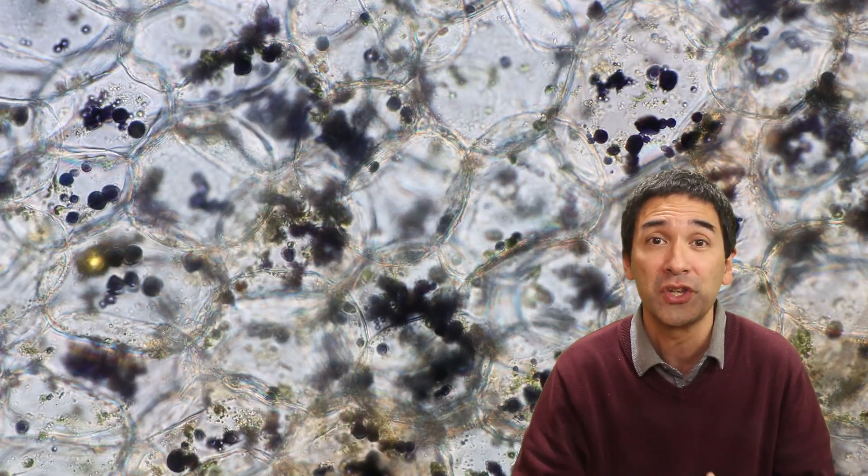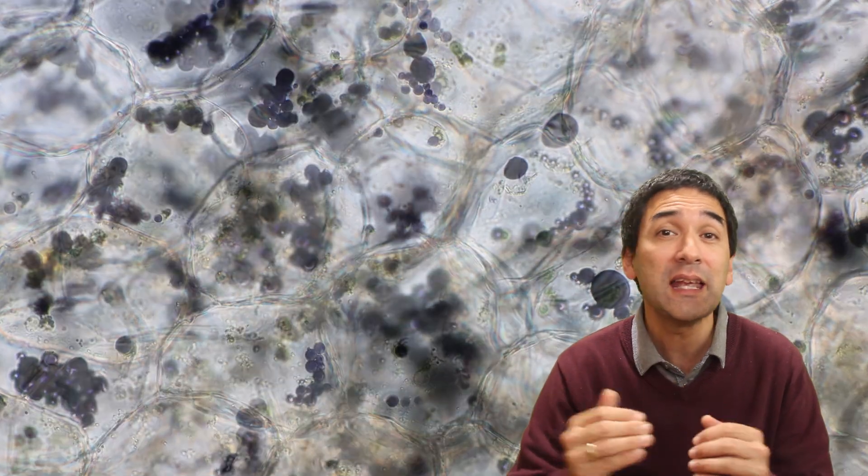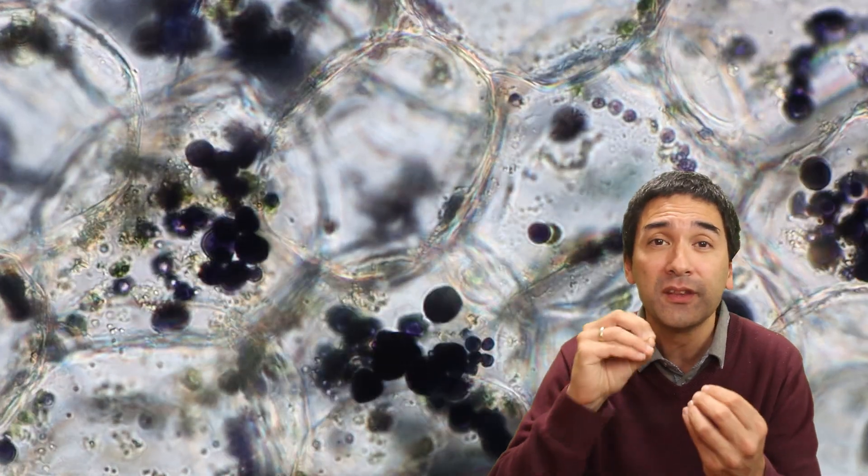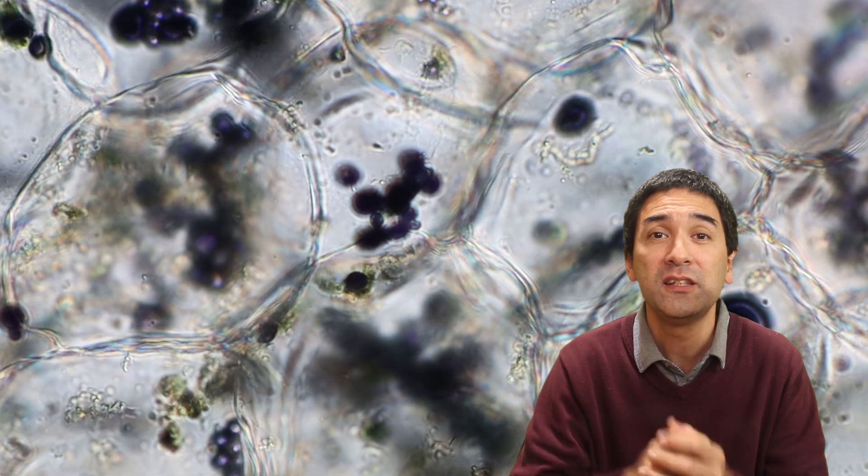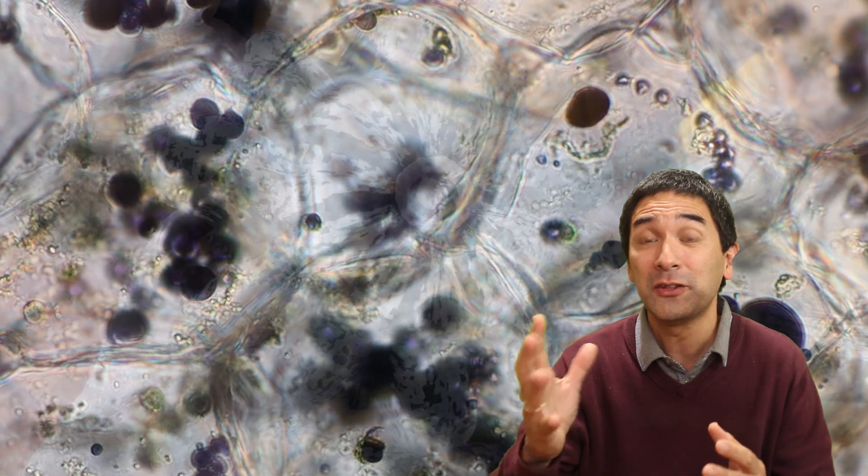Here we can see the pumpkin cells that I've made very thin cuts of and stained with iodine. The iodine combines with the starch grains and gives a black color. These are now the starch grains inside the cell, and that's the answer.